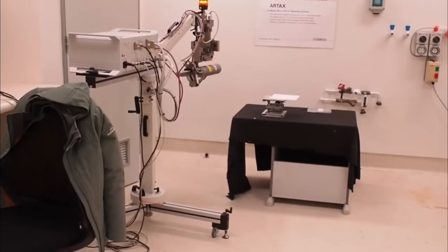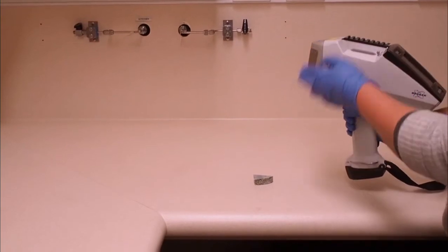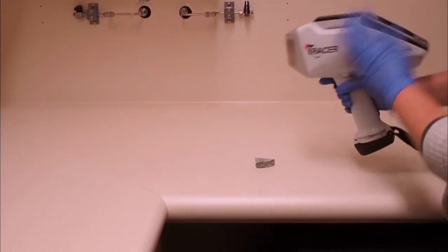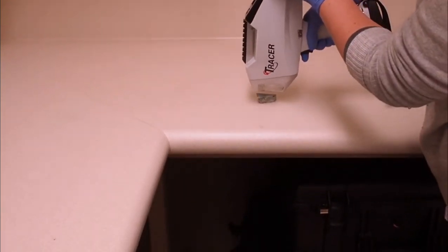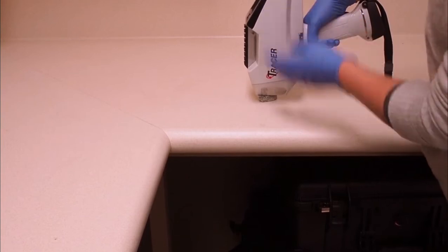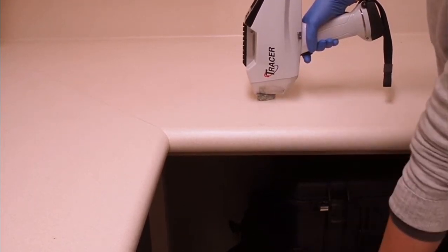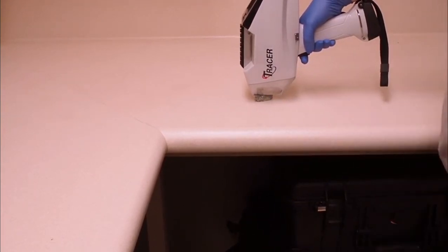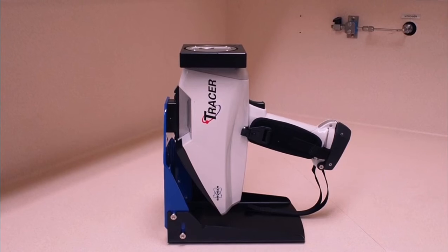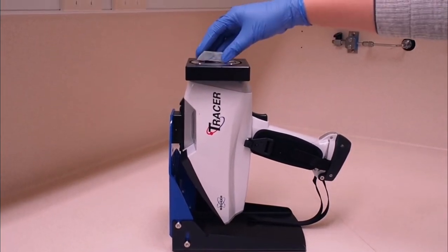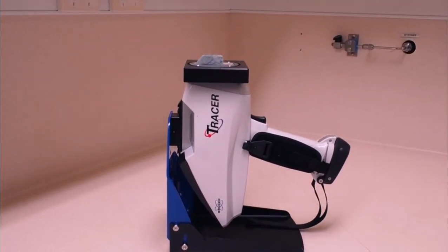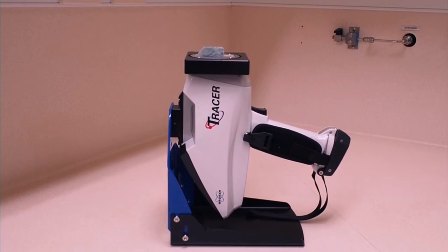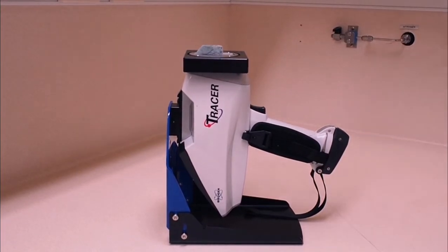Don't forget, x-rays pass through most materials, so if you point the instrument towards a bench, and you are sitting with your legs under that bench, you could be exposing yourself to radiation. For smaller samples, you should mount the instrument on the mounting support and use the radiation shield to eliminate exposure.